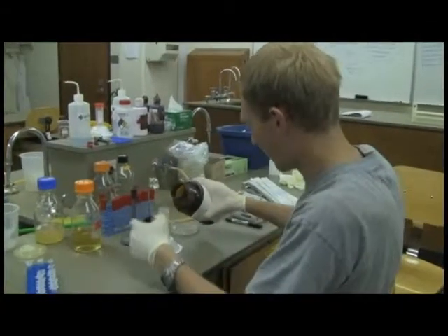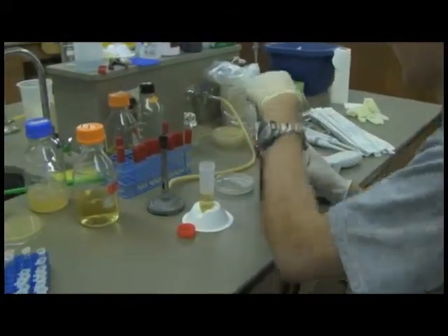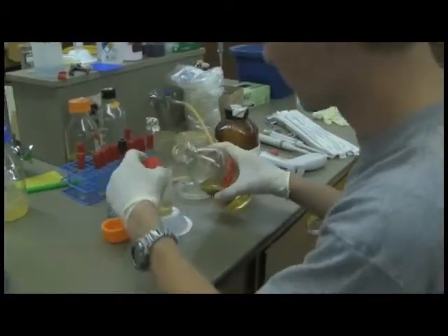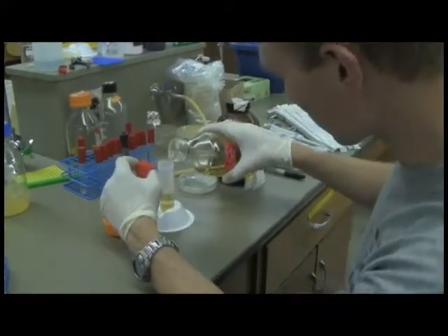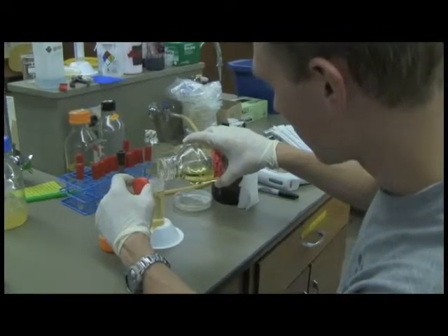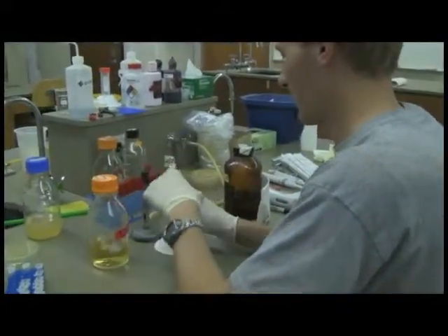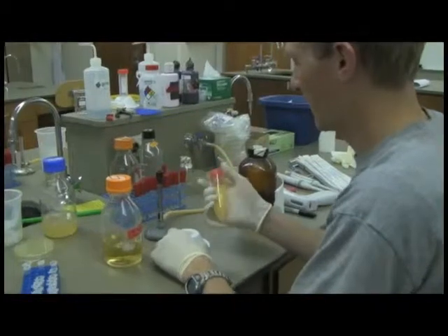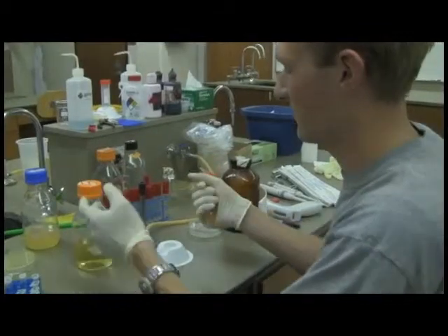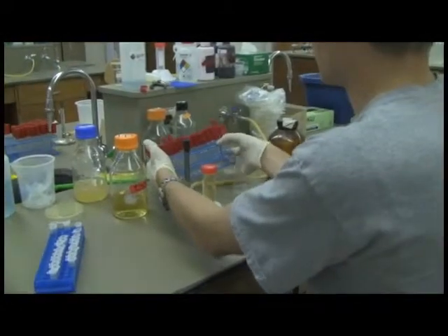So here we're mixing our top agar so that this really warm 2x top agar can be diluted down to 1x and become closer to room temperature and easier to use. Saves a lot of time so we don't have to wait for it to cool down. So we'll mix it up. You can check if it's ready to use if you can hold it without it being too warm to hold. It's about good.